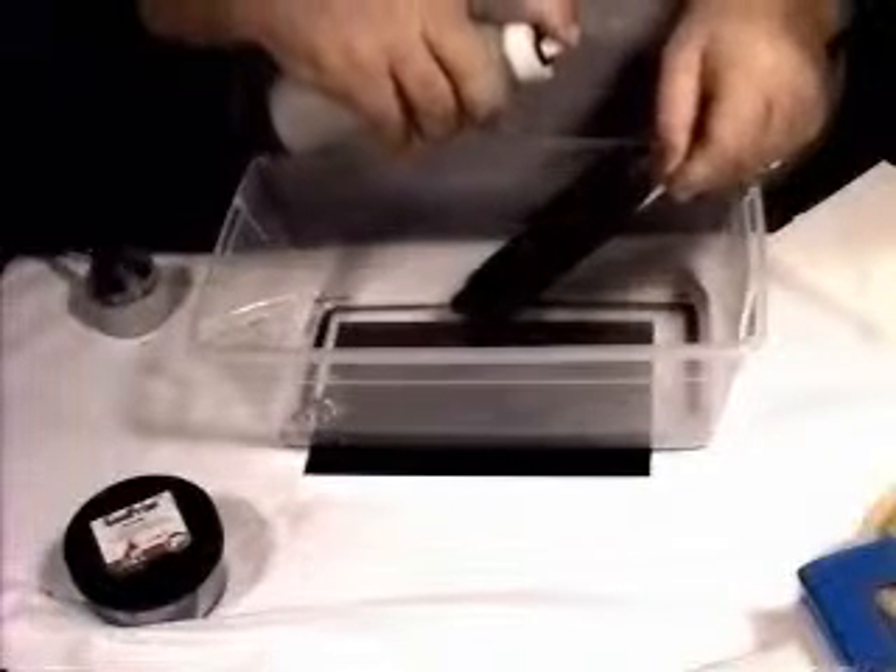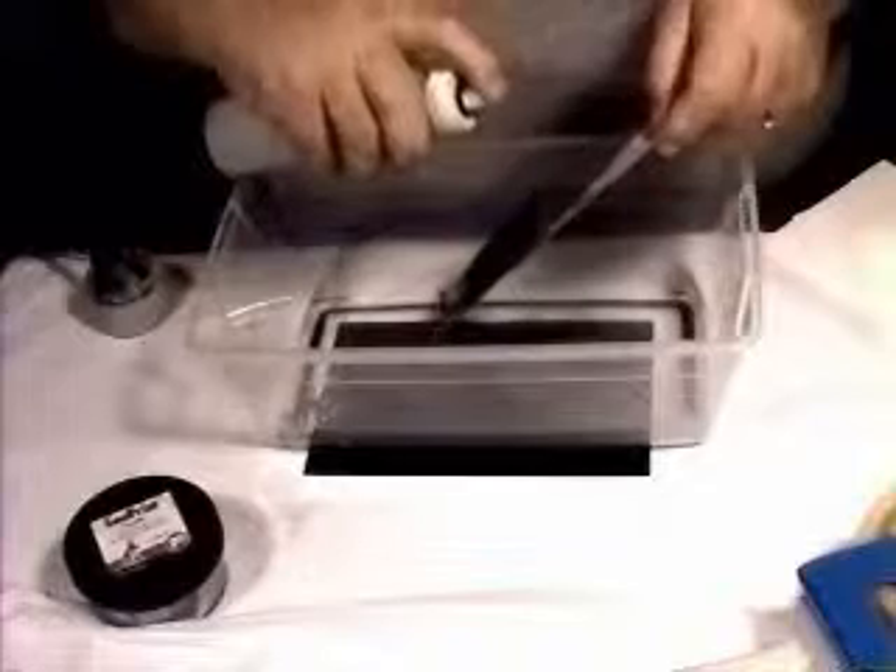Then we will take, using standard tap water, after the allotted time is up, we will spray it off. And you have developed fingerprints on the adhesive side of tape.